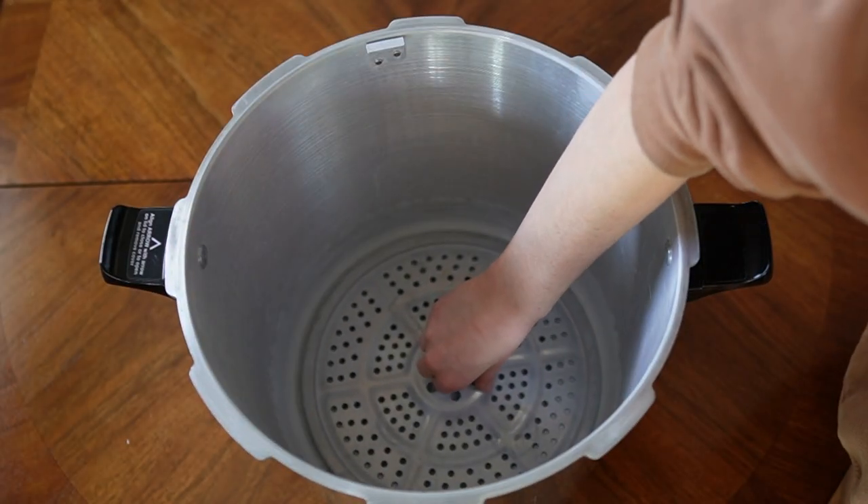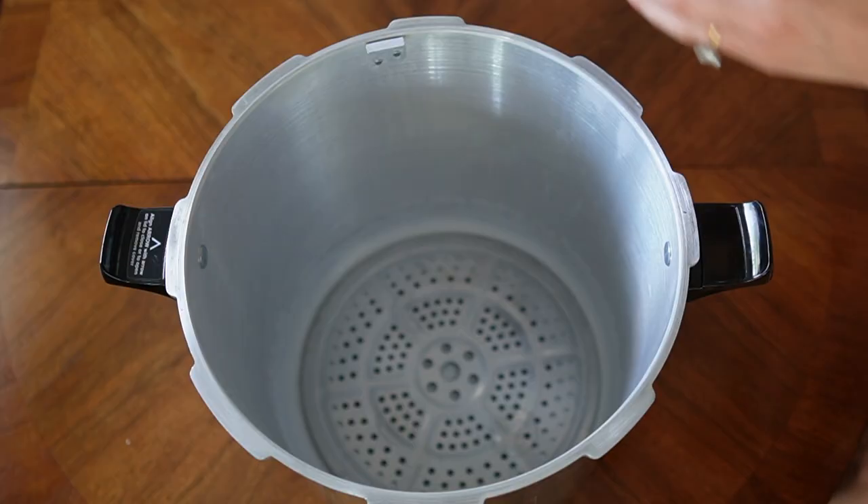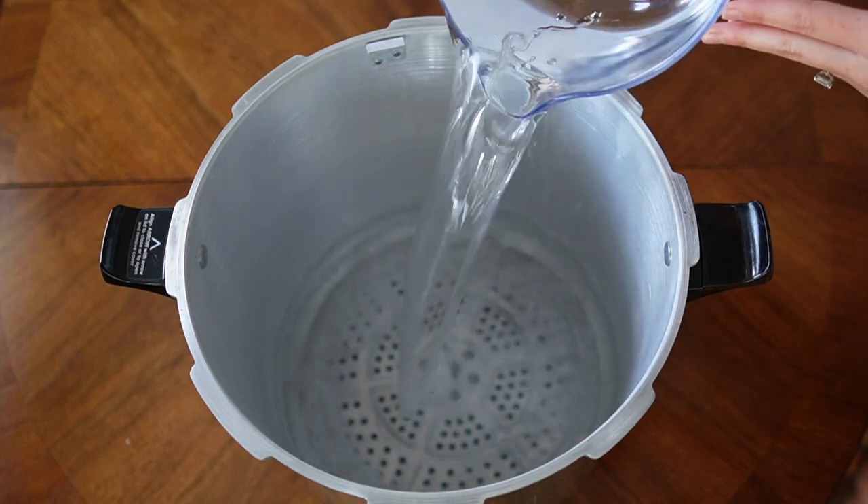First, place a cooking rack on the bottom of the pressure cooker. You never want to place anything directly on the bottom without a cooking rack. My pressure cooker requires 12 cups of water, so that's what I added. Depending on the size and make and model of your pressure cooker, the amount of water you need to add may be different.